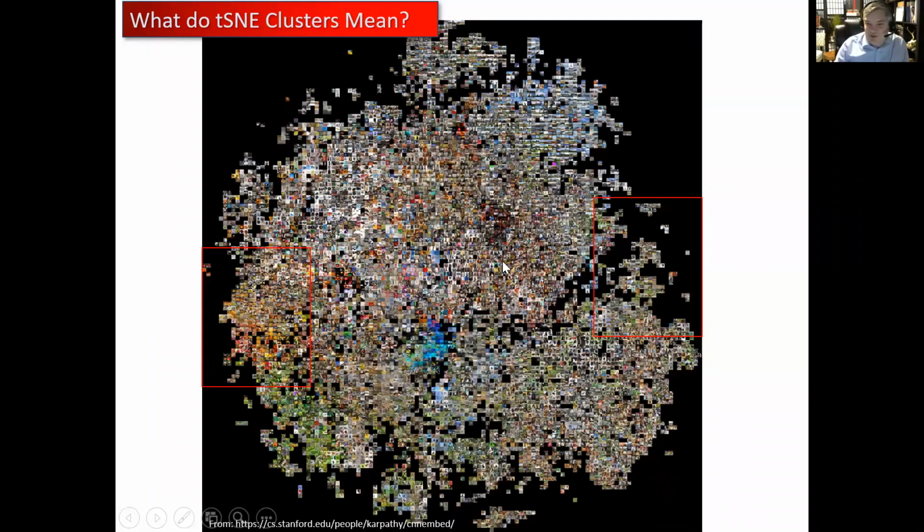And if we zoom in on these two red regions that I have highlighted here, you can see what was found is a little cluster of pumpkins here. I know this one's kind of hard to see. It's people fishing, or pictures of fish. There's pictures of pies, there's pictures of mushrooms. But again, if you're looking at this from a scientific perspective, you have to come in here and label this stuff, right? So these guys are fishing.